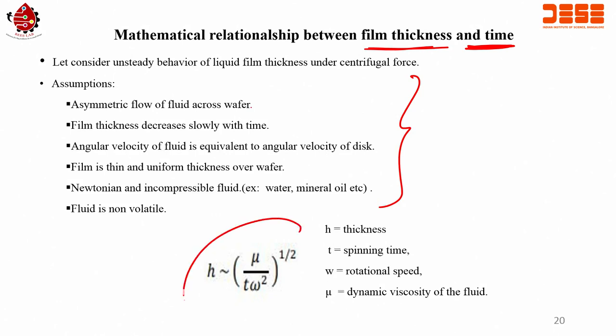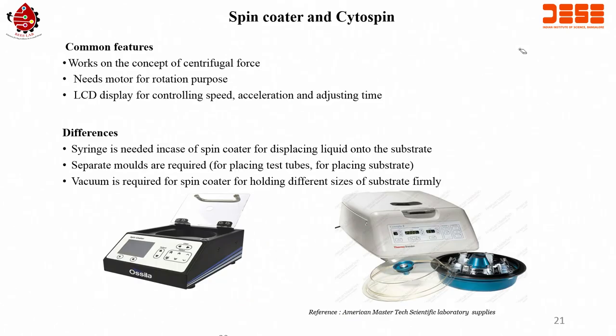And here you can see how the film thickness is related to the dynamic viscosity of the fluid, the rotational speed of the system, and the time of the spinning, right? So, this is the mathematical relation if you guys are interested in.